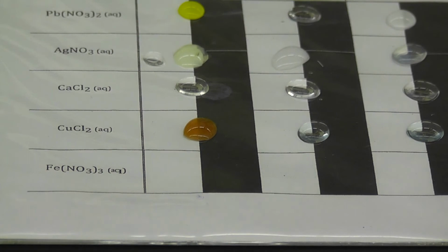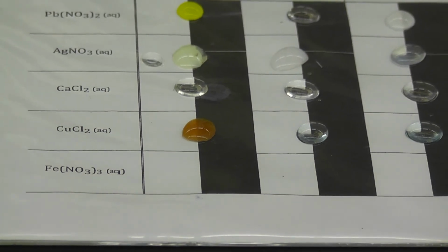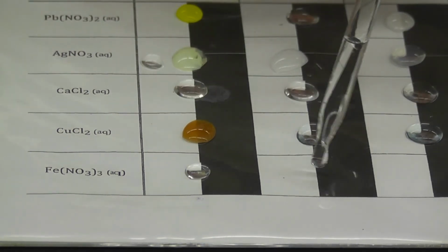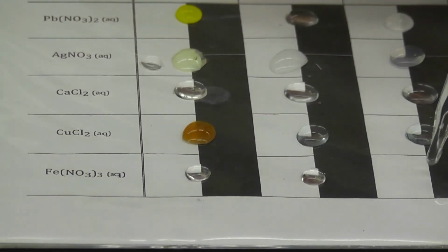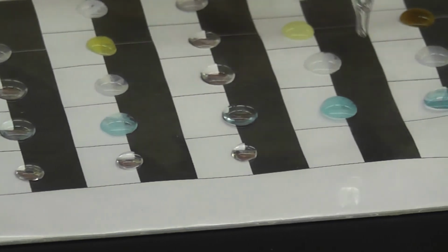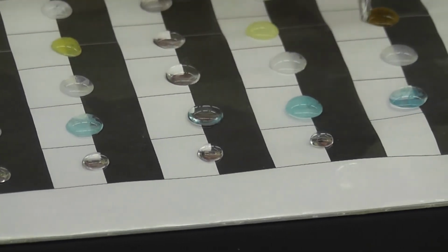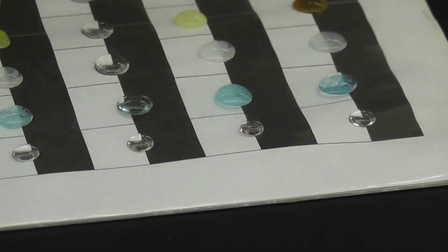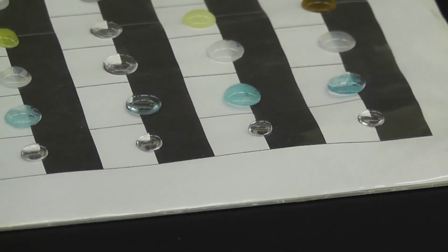Okay, this last row is the iron 3 nitrate. So I'm going to do the same thing, put 1 drop of iron 3 nitrate across the row. Okay, 1 drop. So this is the iron 3 nitrate that I'm putting across. And I'm still getting it in between the black and the white as best as I can, so that way I can see both color change and precipitate form. Okay, so the iron 3 nitrate is across the row.